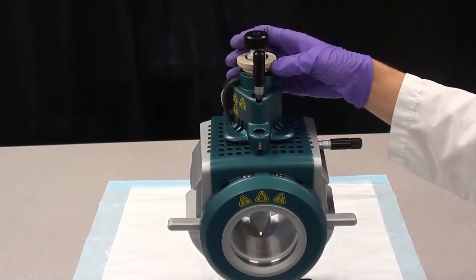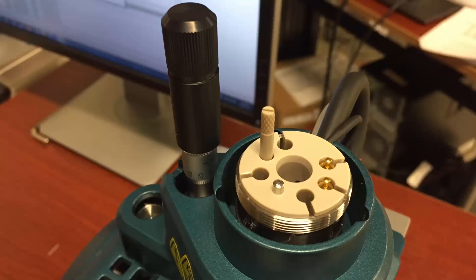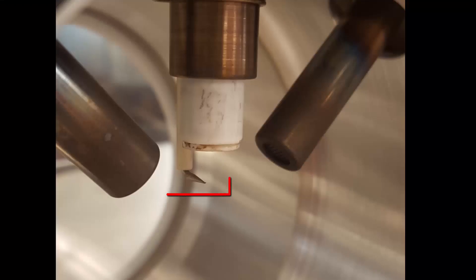Tighten the retaining ring until finger tight. If you're using the APCI probe, adjust the corona discharge needle tip before you insert the probe. Use the adjustment screw on the source to rotate the corona discharge needle tip so it points towards the curtain plate aperture.